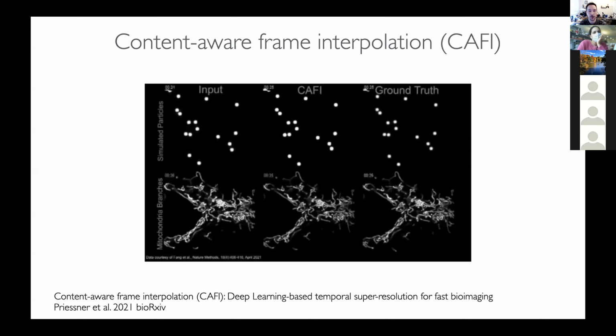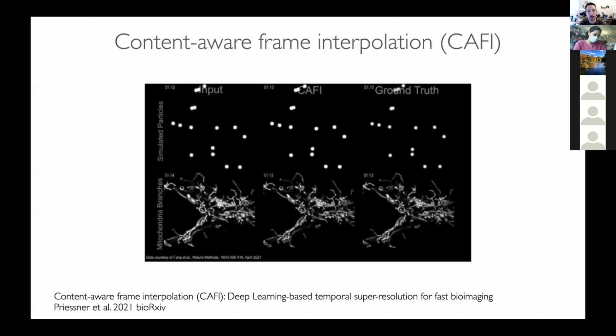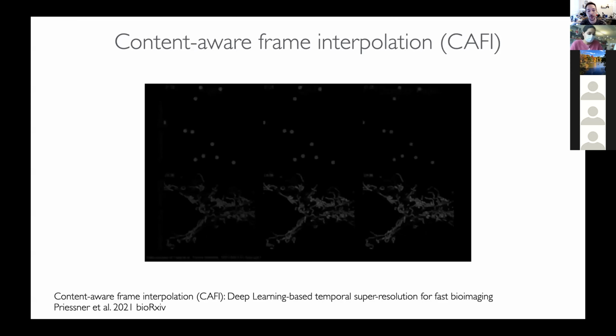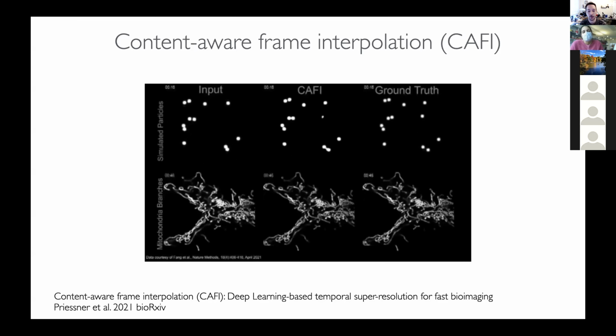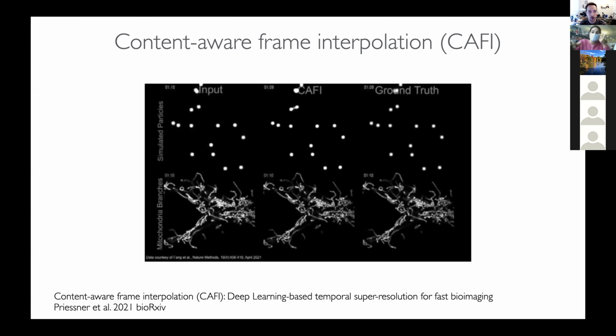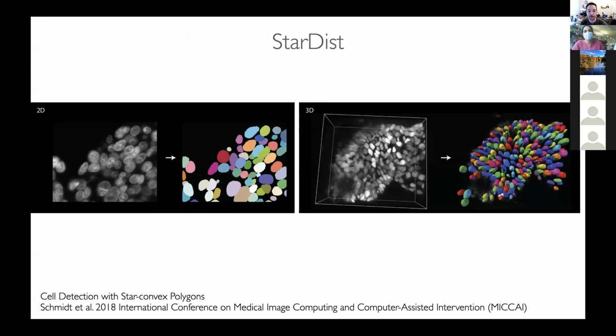And this approach is much better than typical approaches people use to estimate where those objects are between frames. This is something that they've recently released and is available to start to improve sampling. Use like 2-fold, but also 4-fold examples are still quite reasonable.